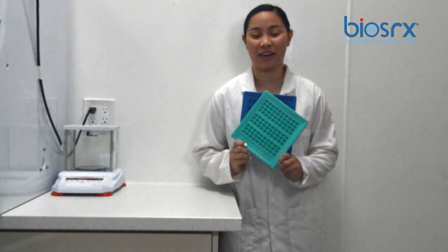Hello, my name is Alma, a pharmacy student who works in a compounding pharmacy, and today I want to give you a review on these trochee molds from BiosRX, known as the RD trochee molds.